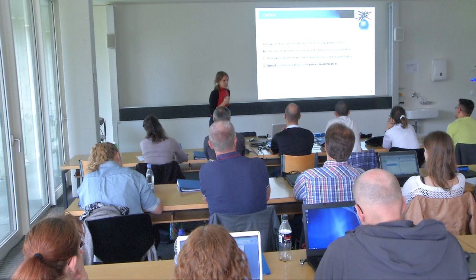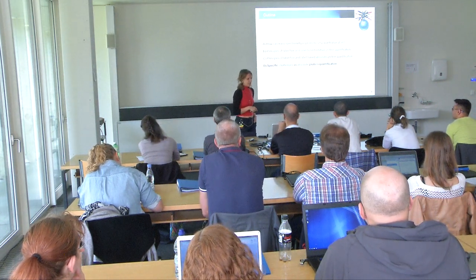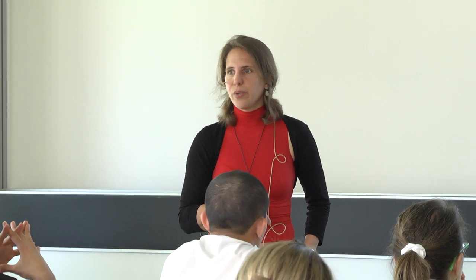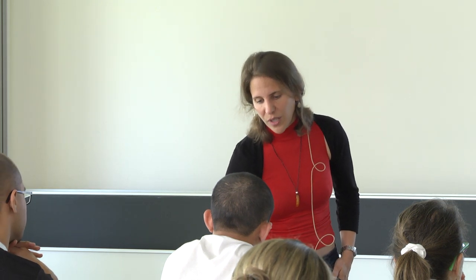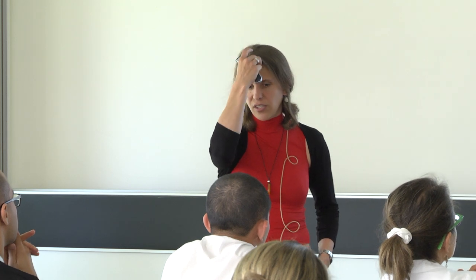No? Good. Then I will very quickly run through this last part, which is really just a collection of some specific tips and tricks for people who would like to do absolute protein quantification, and what's important to consider. Many of these things we actually said already.